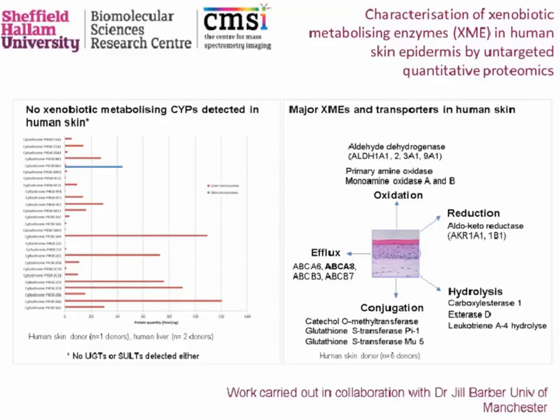As I said, the skin is actually an active organ and it is involved in metabolizing xenobiotics. In another project that we carried out in collaboration with a company called Phenatox, with Innovin again and with the University of Manchester, we were interested in how the model stacks up against human skin in terms of the presence of metabolizing enzymes, because there are lots of enzymes present in skin, as I mentioned earlier, and you can see those on the slide. So the analysis that we did initially was by conventional LC-MS-MS-based proteomics of human skin to look at what enzymes were present.